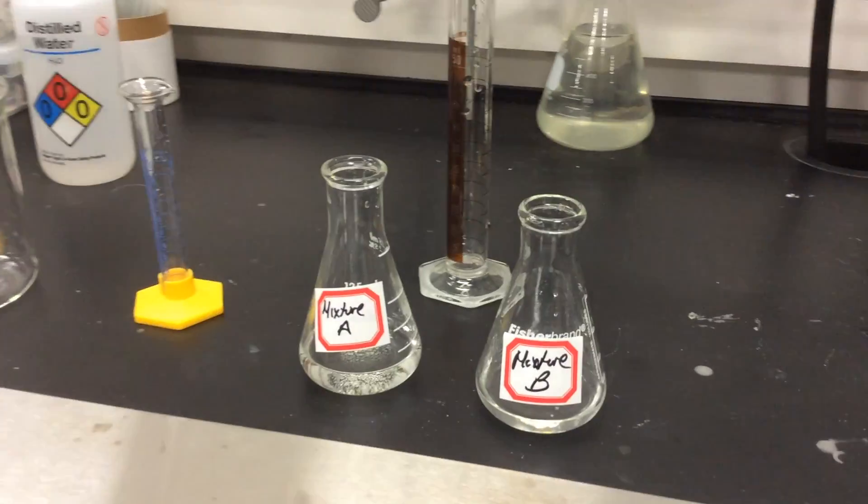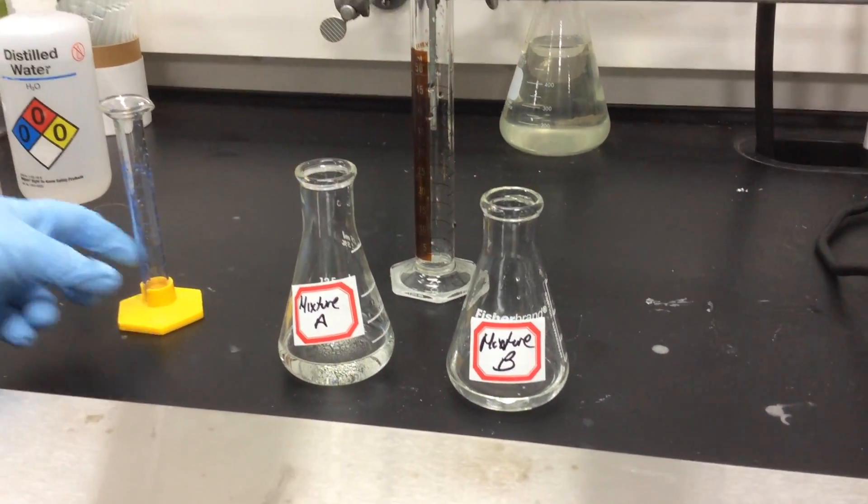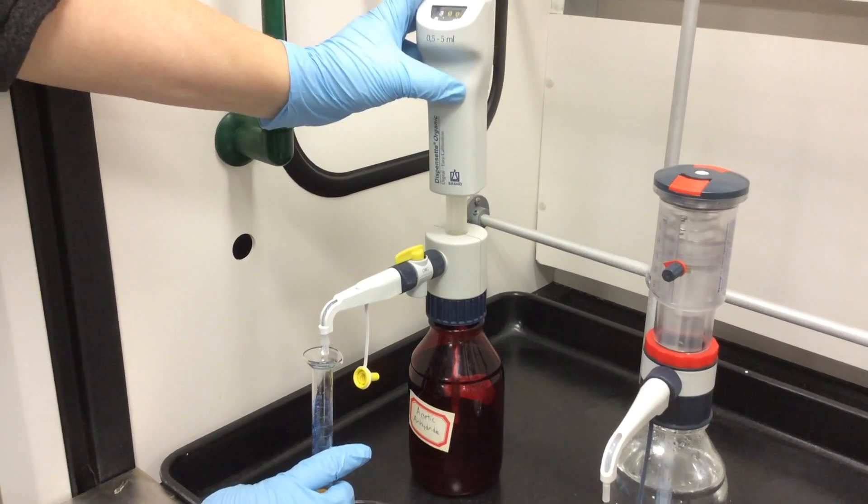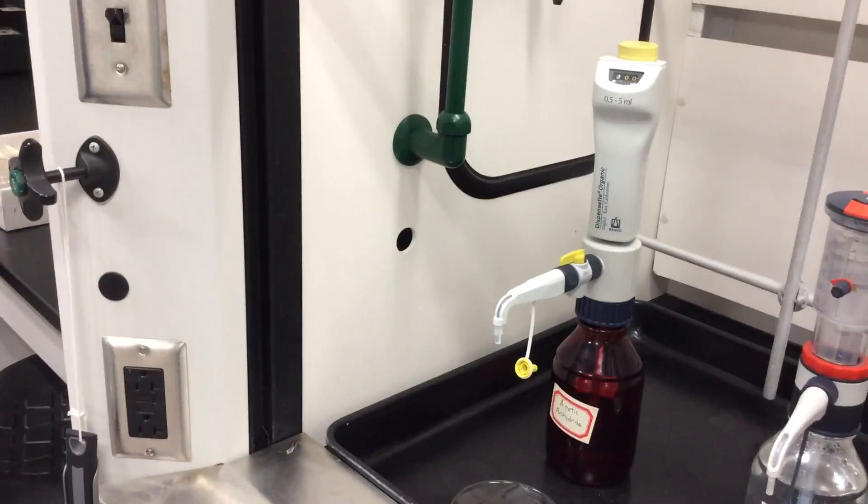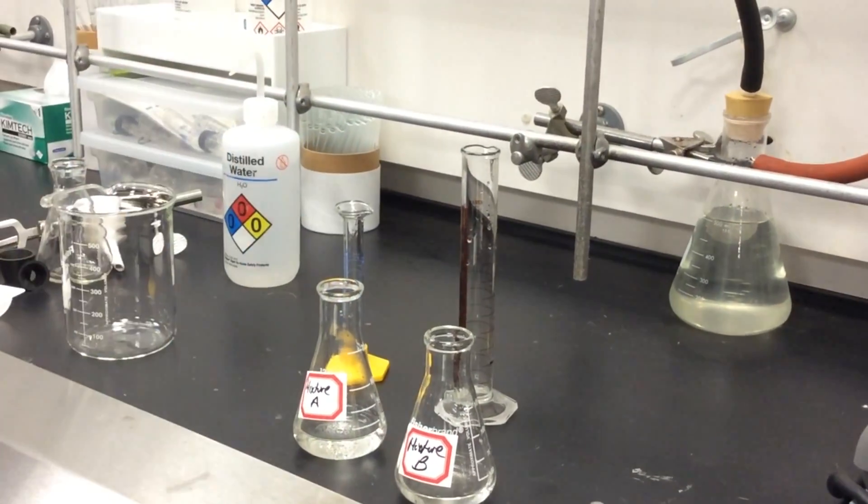We're going to now go back over to our dispensing hood, and once we're at our dispensing hood, we're now going to add 3 milliliters of acetic anhydride using the pump the same way we did before and come back and pour it into our mixture B flask.